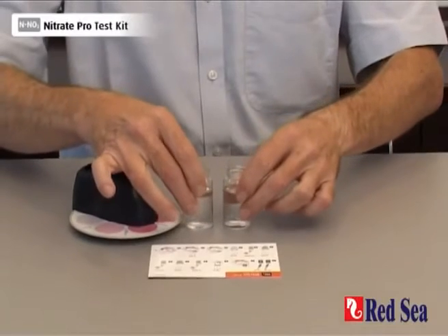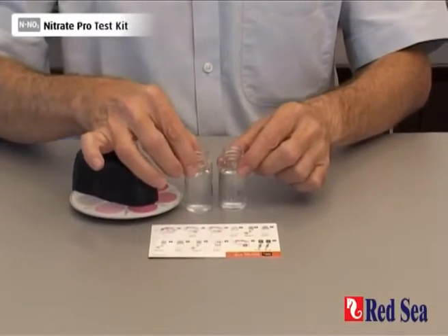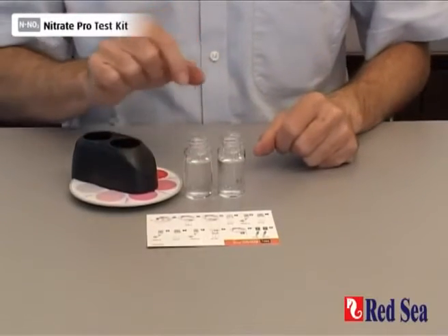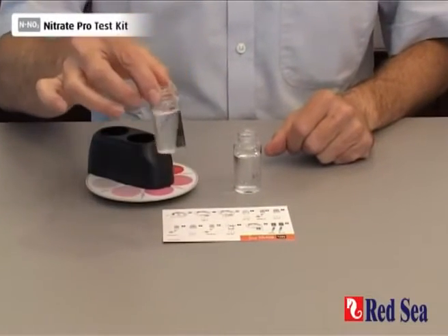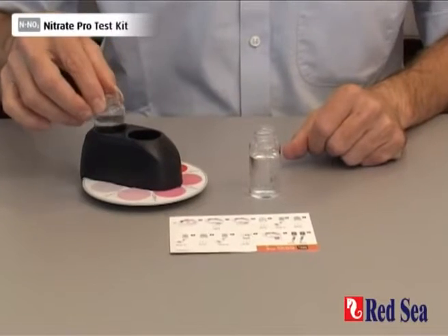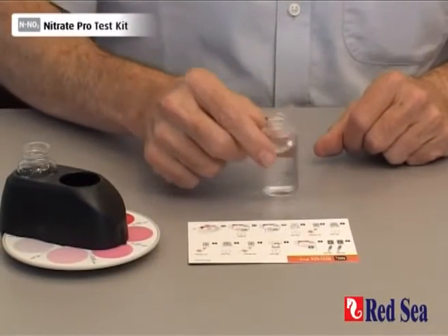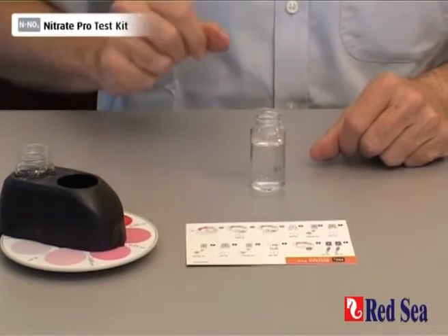I have prepared two vials, each with 16 ml of water from the aquarium that we are testing. Take one of the vials and place it into the outer hole of the comparator and put it to one side. We will now do the reaction in the other vial.